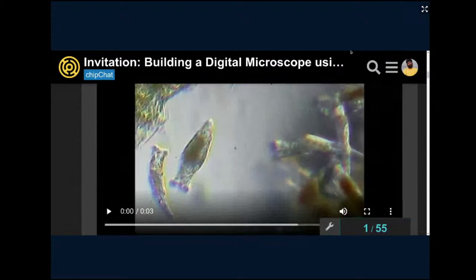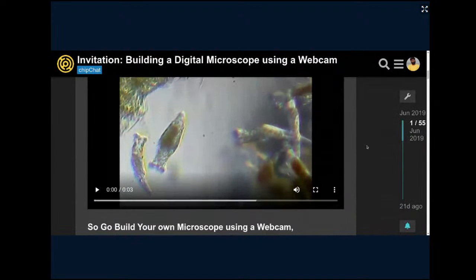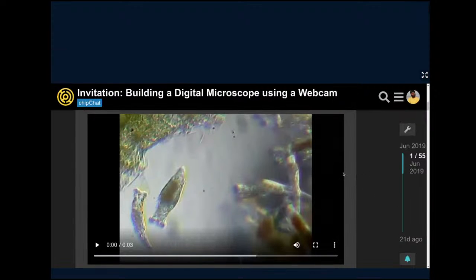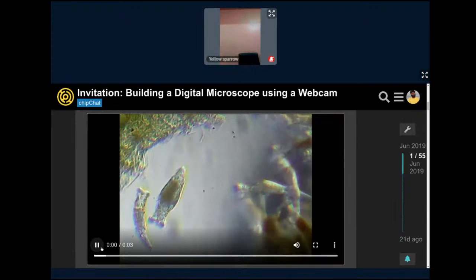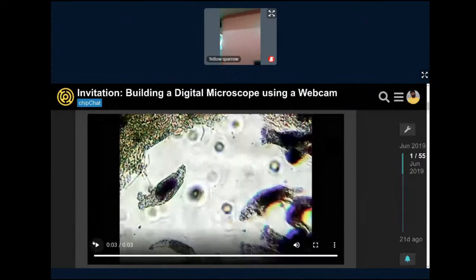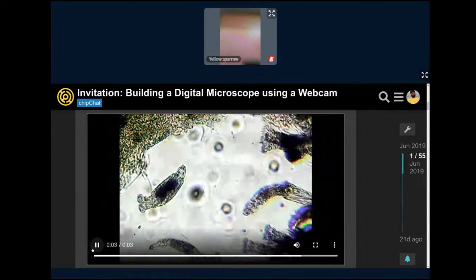So we start seeing very small things in the stagnant water that a GN has collected from the drain. There are a lot of things, as all of you have earlier mentioned, which are not visible to our naked eye, but which are very small.